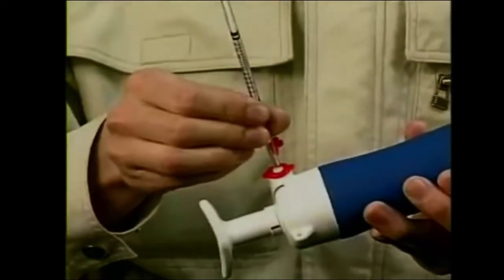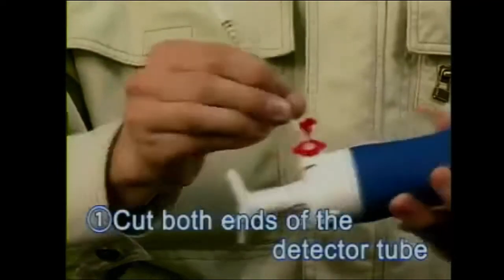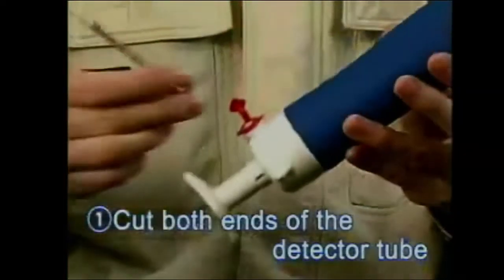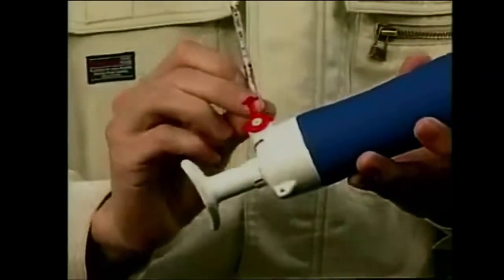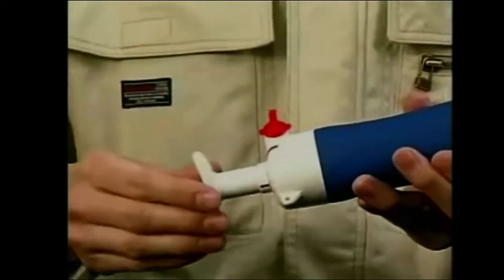Rotate the detector tube to score the glass. Then pull the detector tube towards you to break off the end of the tube. Repeat the procedure with the other end of the detector tube. After cutting both ends of the detector tube, close the cap to the tip cutter.